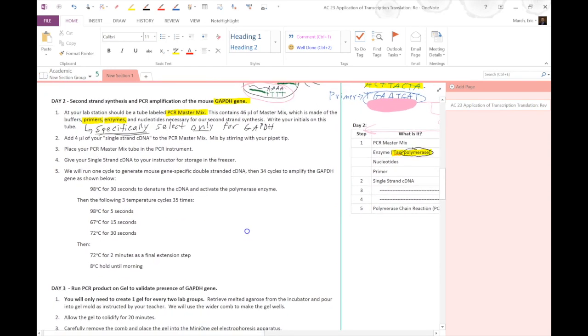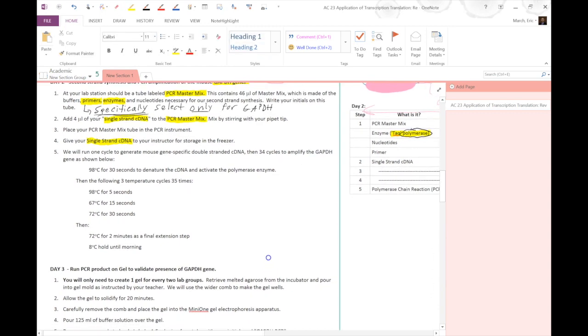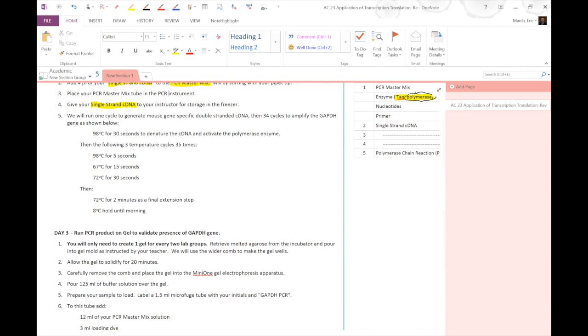So we're going to add all of this stuff to our PCR tube. Notice we're going to save our single-stranded cDNA. That's our tube from yesterday. So we're going to add a little bit of our tube from yesterday, the single-strand cDNA, and the PCR master mix. That's the tube we're going to use today. We're going to store the one from yesterday in the freezer, and then we're going to run a PCR cycle. And then we're going to run a couple more. Note we run 34 cycles to amplify the GAPDH gene.